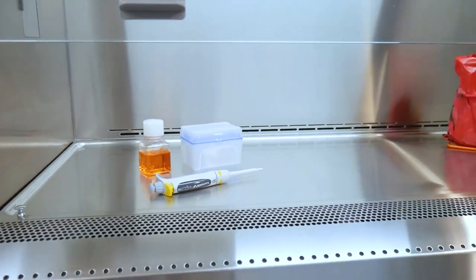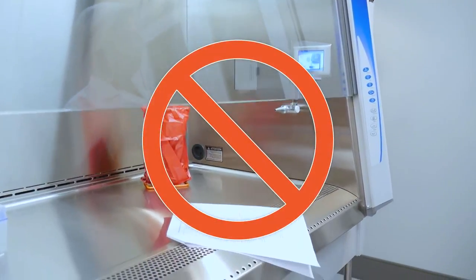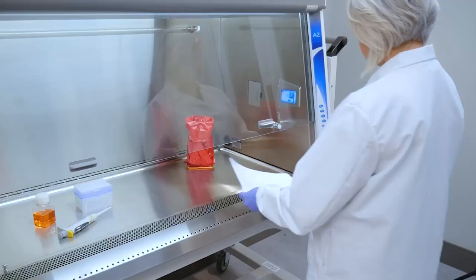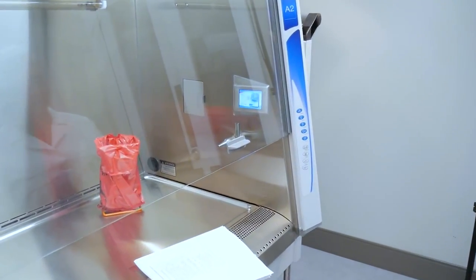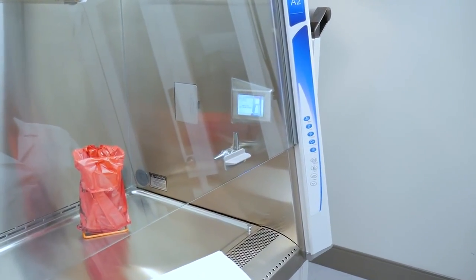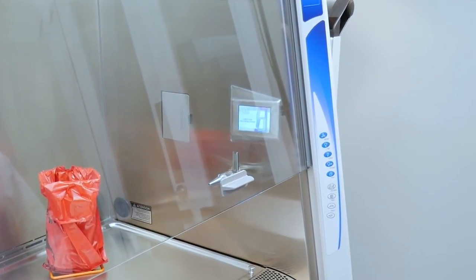Be sure to place materials in the middle of the work surface, taking care not to block airflow grills at the front or rear of the cabinet. The cabinet will alert you of blockages and the cabinet's blower will automatically compensate to maintain safe airflow. However, any blockages should be corrected immediately.